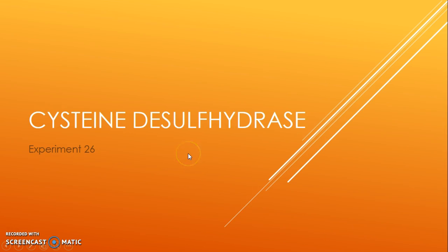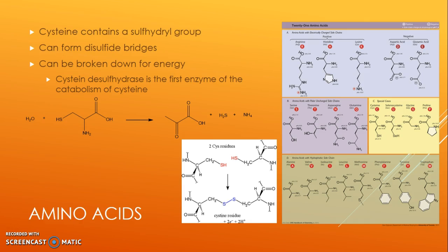Okay. So, cysteine desulfhydrase. All right. Experiment number 26. So, cysteine is just an amino acid. We talked about amino acids having a carboxylic acid group, an amine group, and then that R group coming off, and it has a hydrogen right there. So all that stuff applies. It's just one of the amino acids that contains a sulfhydryl group.